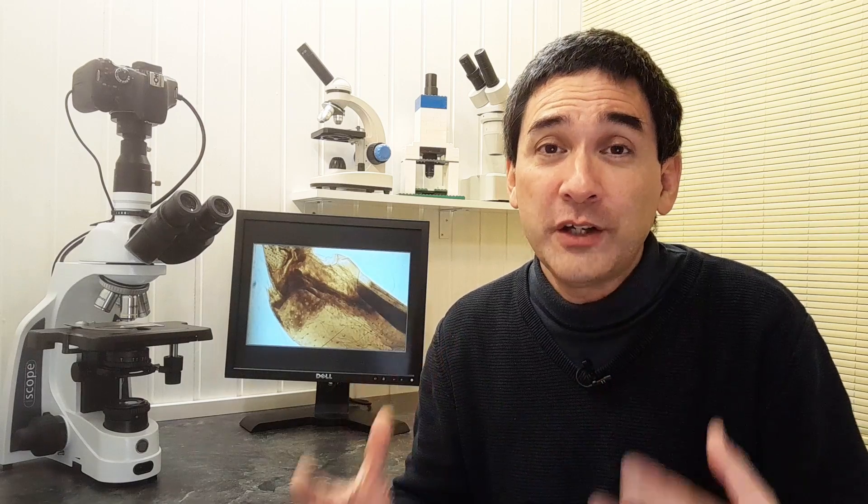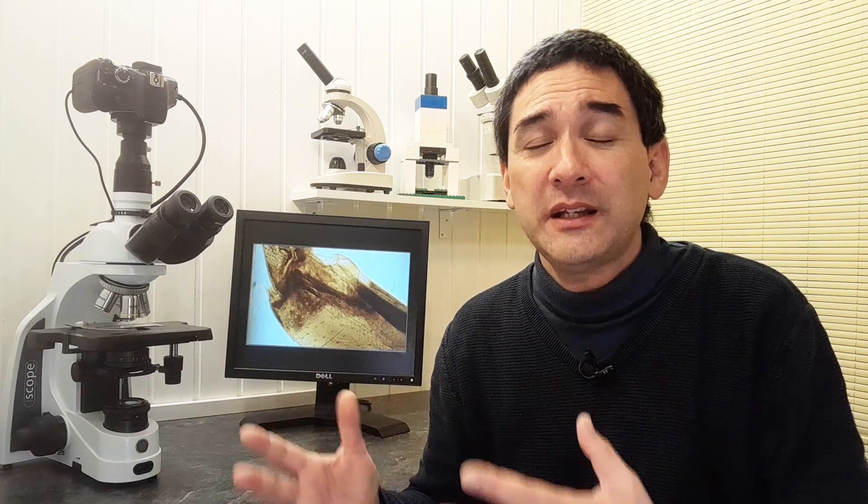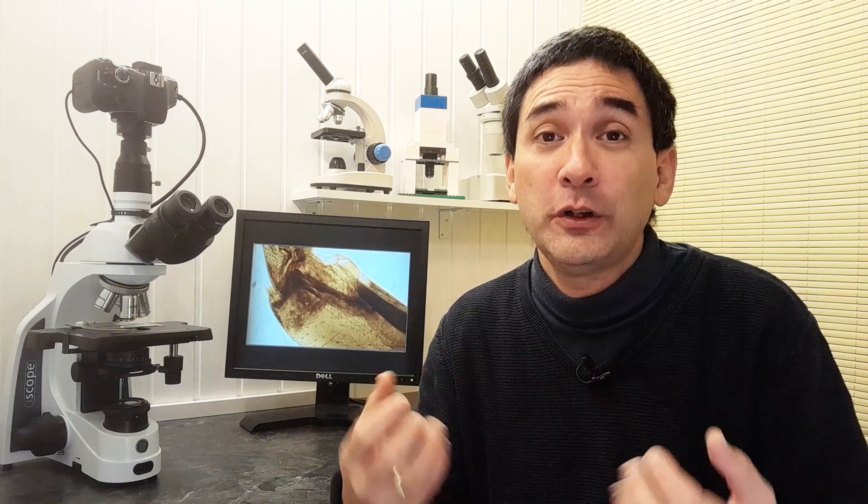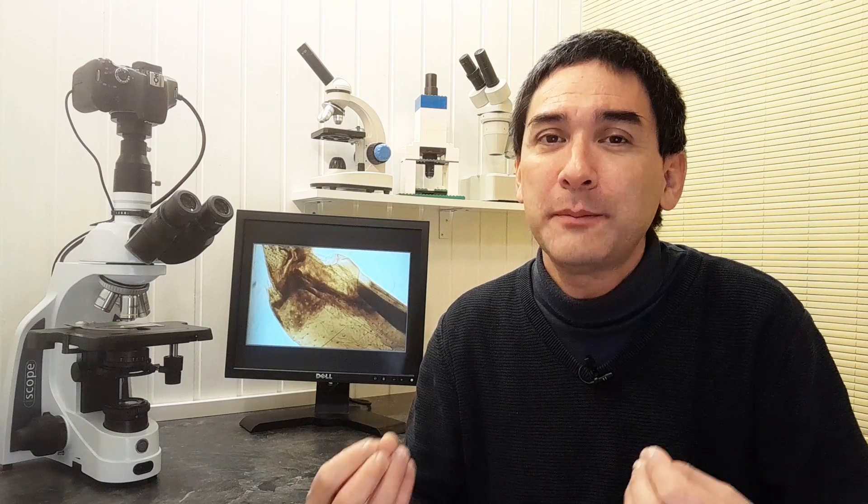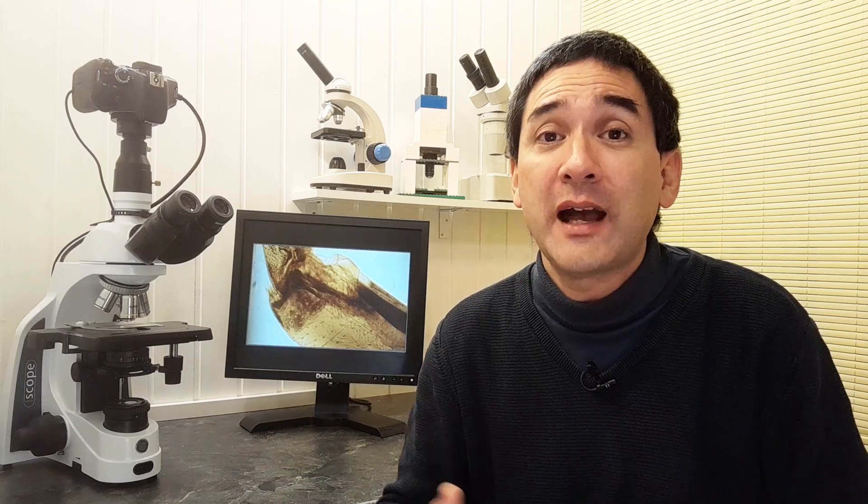And that is, generally, if you want to connect a camera to a microscope, you want to make sure that the sensor, the camera sensor, is fairly large. Now, low-cost microscope cameras, they have very tiny sensors. But if you want to get the best image quality, then you should look for a large sensor camera. Large sensor sizes, they have several advantages. They have a better signal to noise ratio. This basically means that the low light performance is better. They also have a higher dynamic range. So that means the difference between bright and the dark areas of an image are covered better.